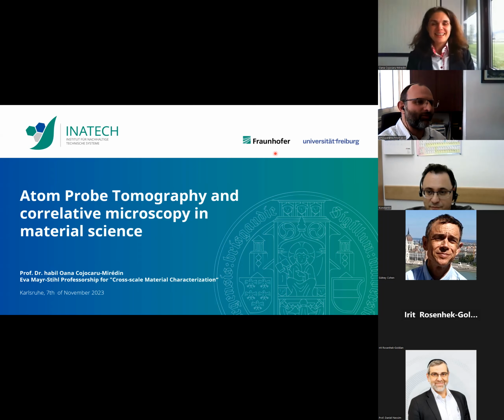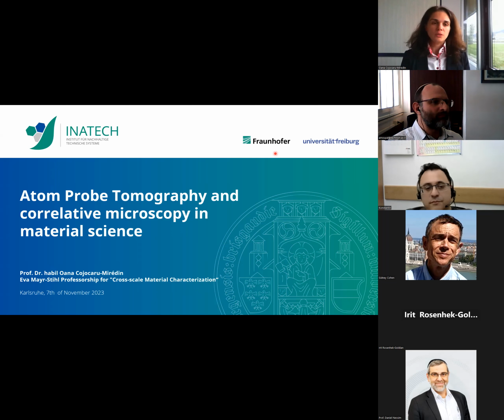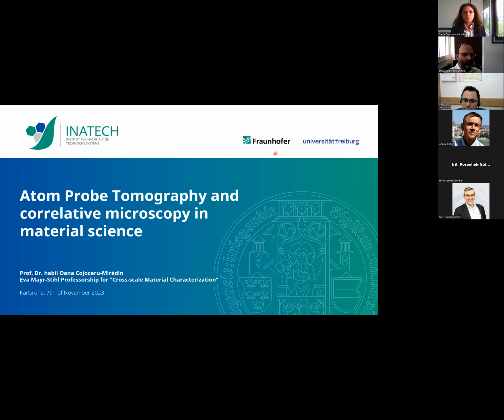Yes, nice. So indeed, today I have the task to present to you the atom probe tomography and the correlative microscopy. Correlative microscopy means the combination of the atom probe tomography with other characterization techniques, so that we can determine several material properties on the exact same position of the sample. And I have the task today to present you some examples of what we can achieve with this new methodology.